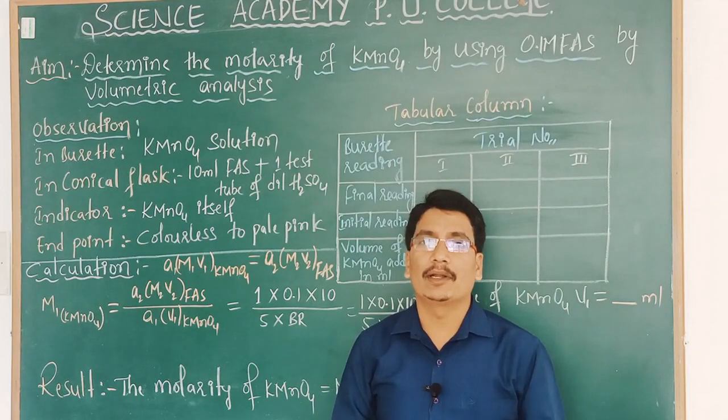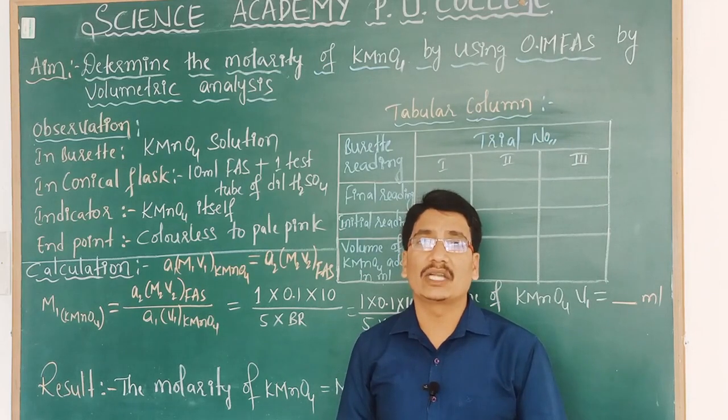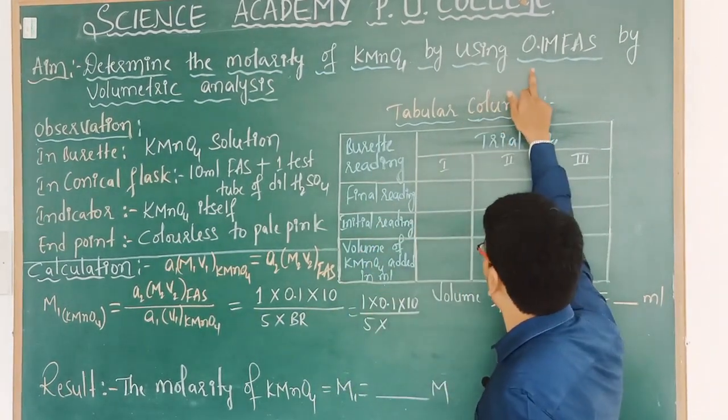In this experiment, we are going to calculate the molarity of one solution by using another standard solution. The standard solution means the solution whose strength is known.